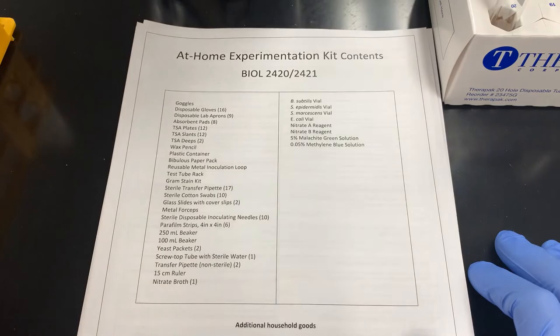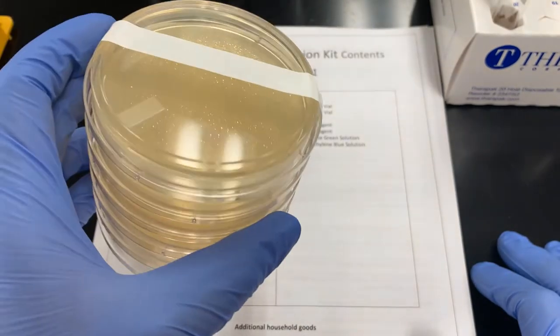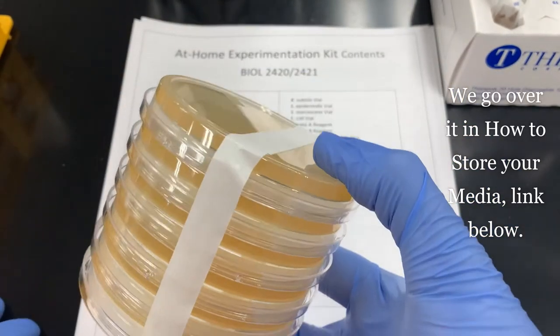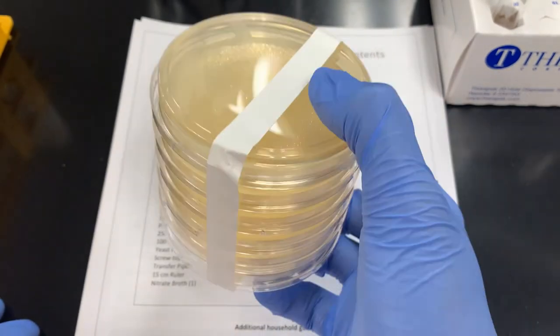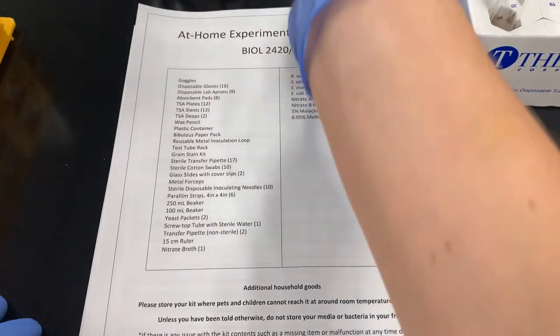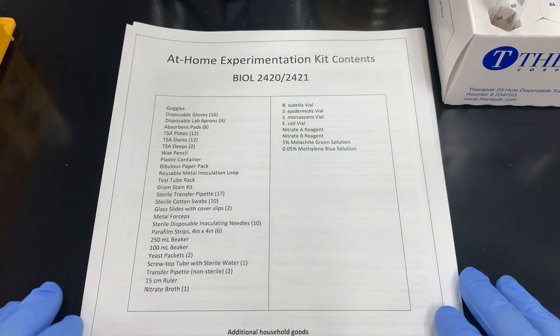Okay, next is TSA plates. You're going to get 2 stacks of 6. They're going to be taped to open it. We'll go over that in how to streak your bacteria, okay? You're going to get 2 sets of 6. We gave you 11 for the labs plus 1 extra in case something goes wrong or something doesn't look right or some mold grows on it or something. So we did give you 1 extra.